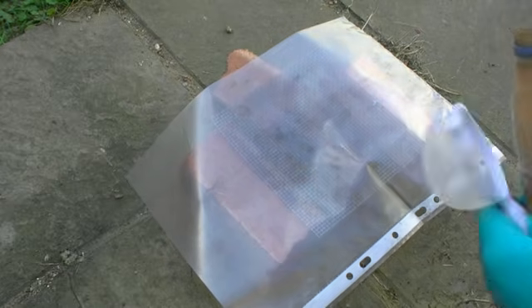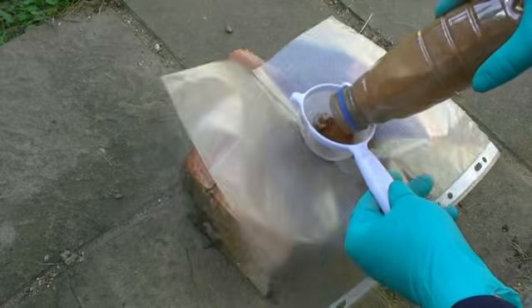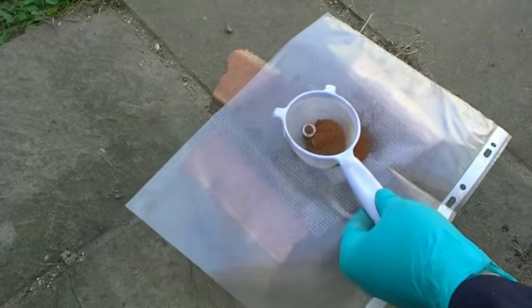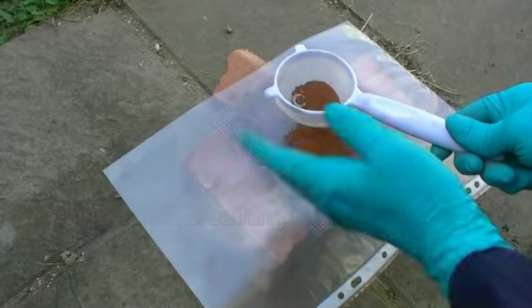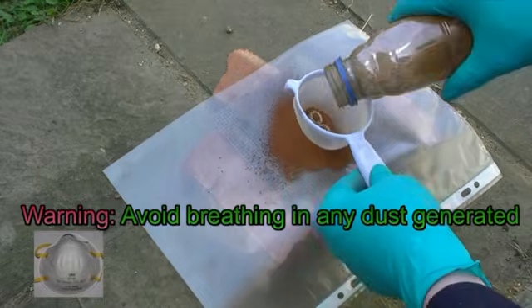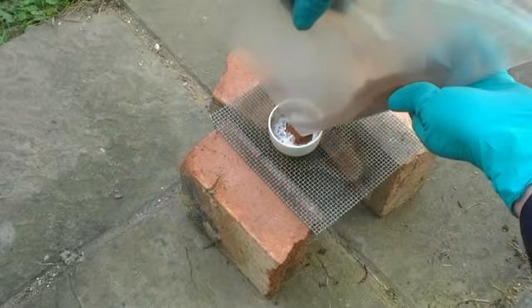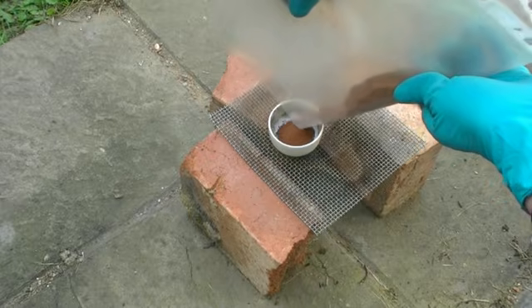To fully oxidize our copper to copper 2+, its highest oxidation state, we're going to roast in air. We're going to sieve our powder to remove any large agglomerates and provide us a fine powder ideal for roasting. We then add our sieved powder to some clean, heat-resistant ceramic dishes.